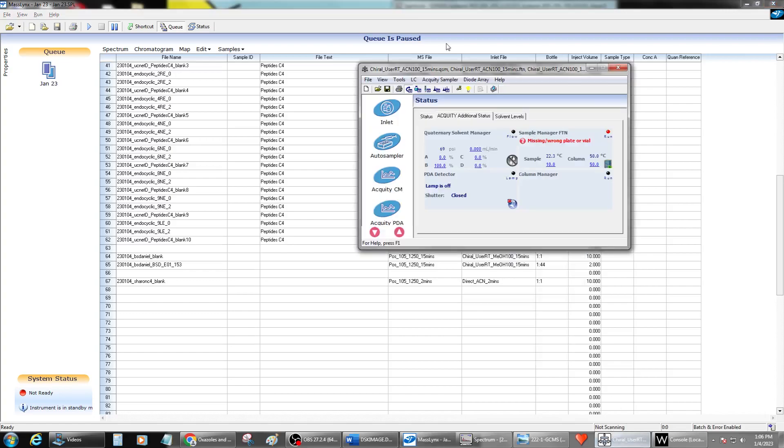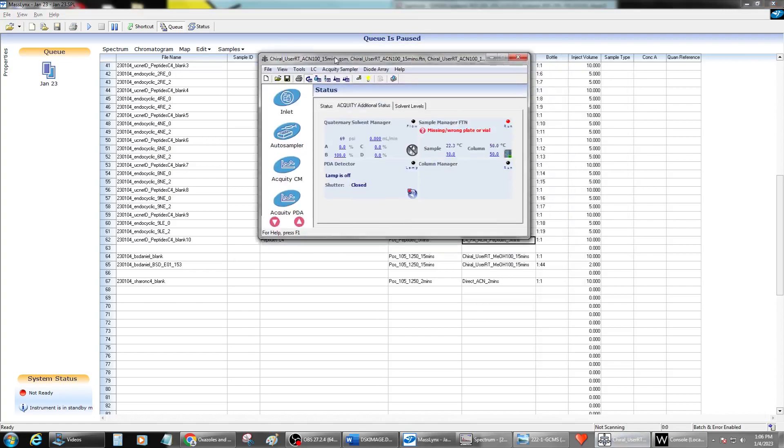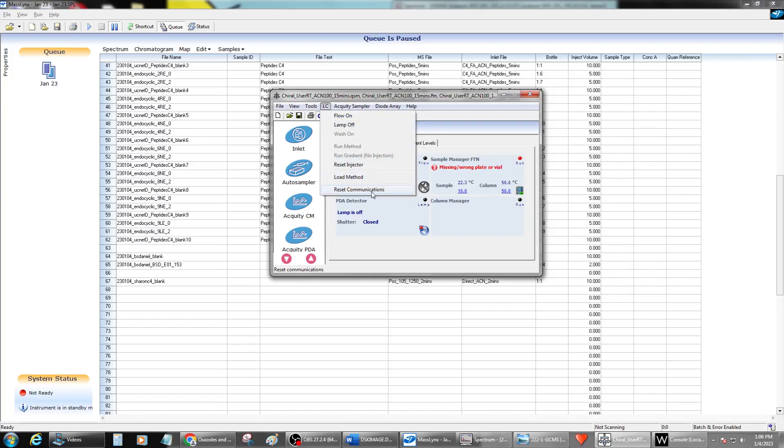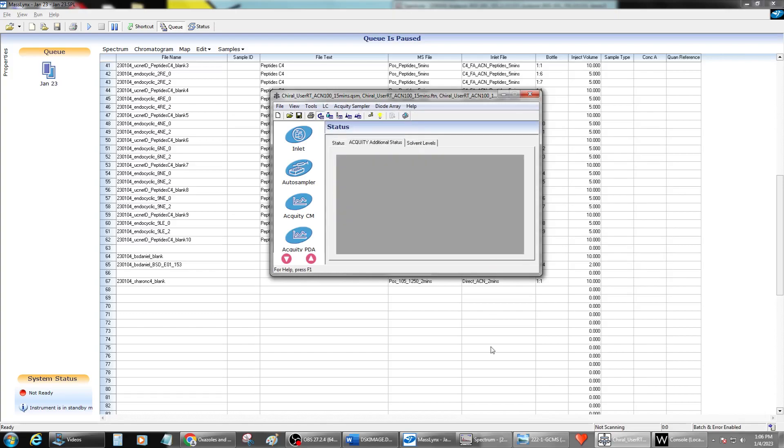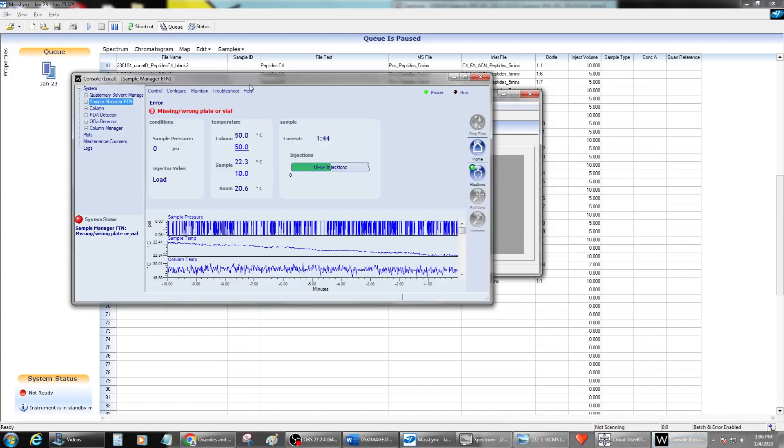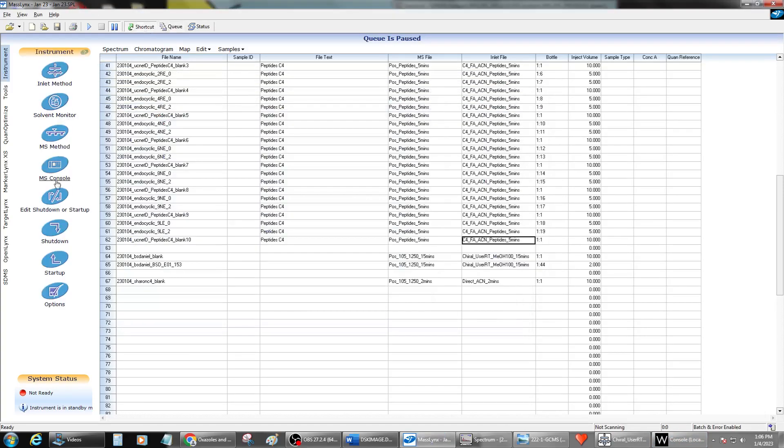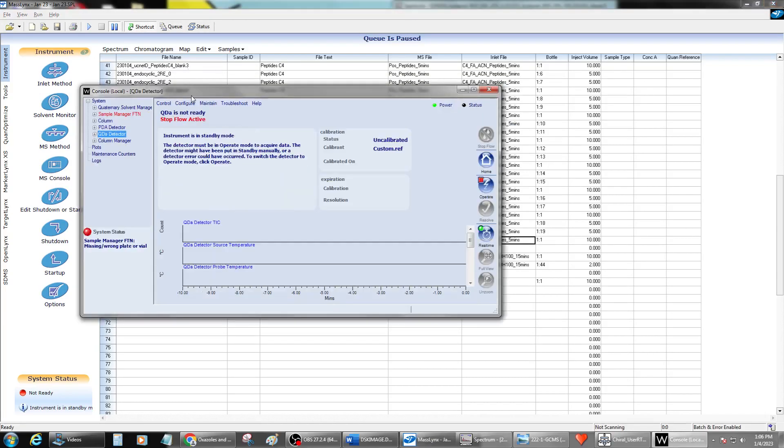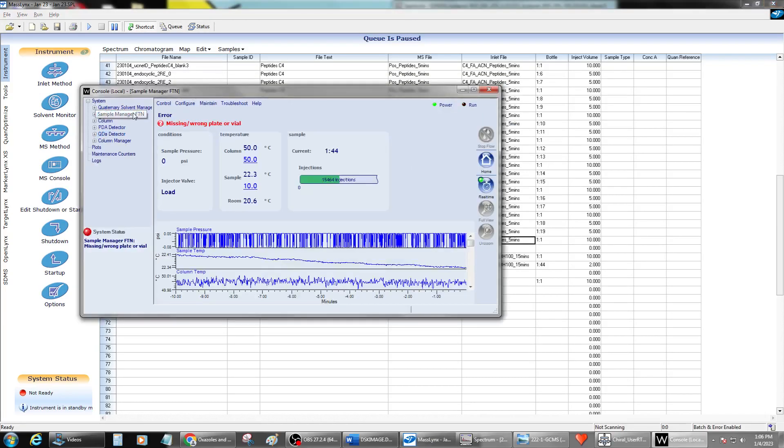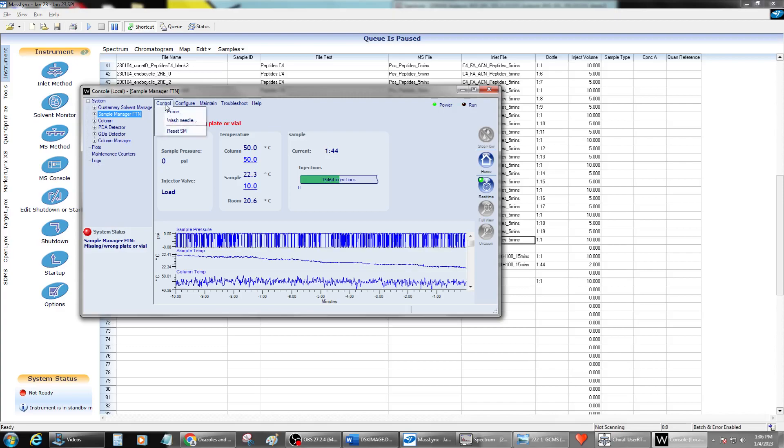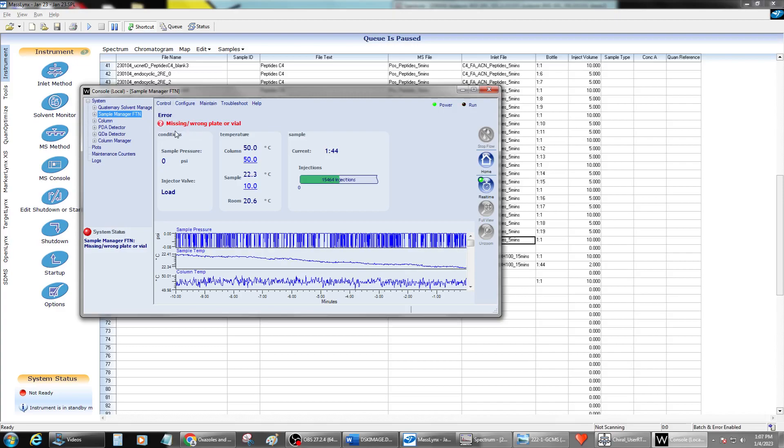That will open up this inlet manager. Whenever there's an error, I like to go ahead and reset the entire stack first, which then frees up a lot of the things you can do in the console. So if you get to the console, you would then go into the shortcuts and open the MS console. In the MS console, now you see there's an error on the sample manager and you can reset the sample manager to clear that error.